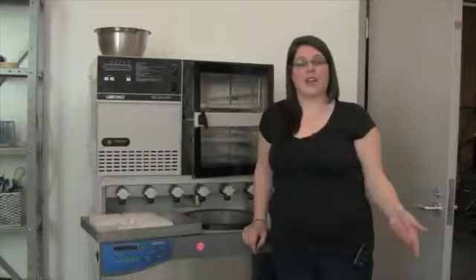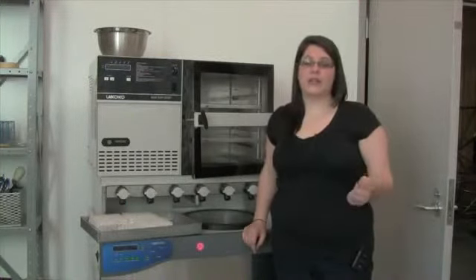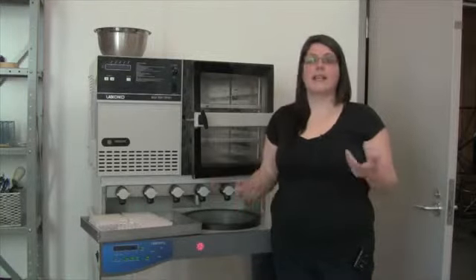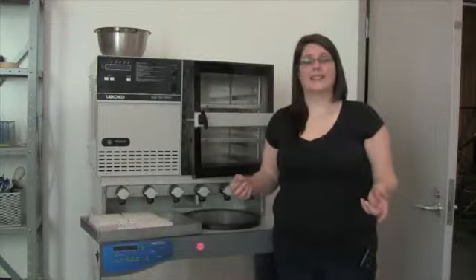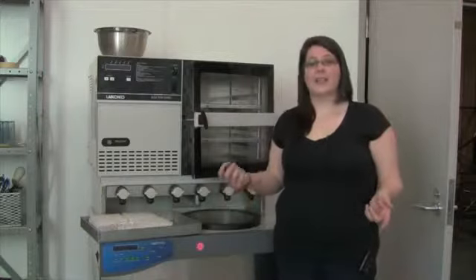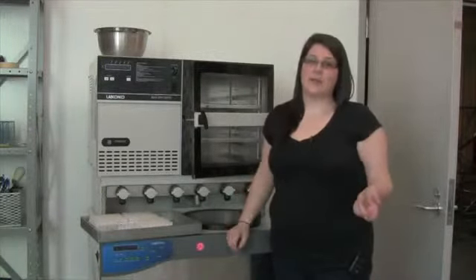Stable isotopes of carbon and nitrogen are commonly used in aquatic food web studies to illustrate trophic position, so where an organism is feeding in the food web, and dietary source of carbon. Stable isotopes are best collected from a dorsal tissue sample of a fish. Today, I'm going to illustrate to you how to prepare that tissue sample to be sent away for stable isotope analysis.